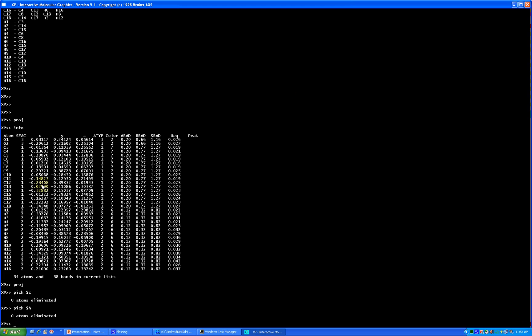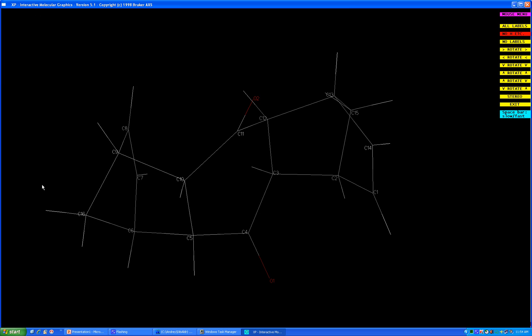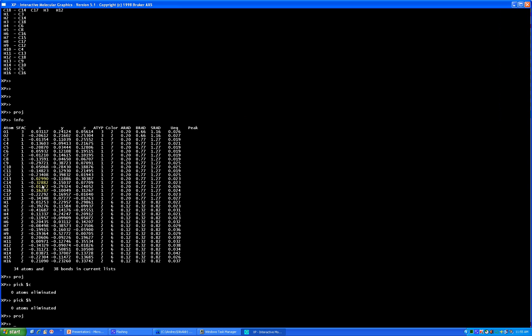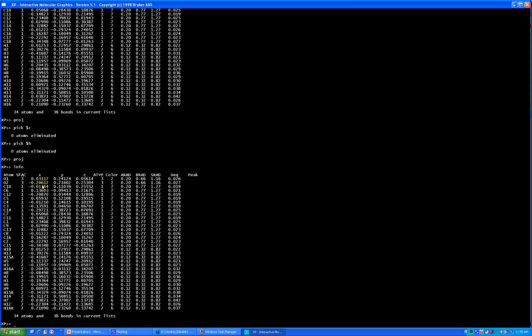Press enter when done, and let's check our numbering scheme to see if we made any errors. Let's display all labels and look — everything looks absolutely fine. All our carbons and hydrogens are labeled. Let's escape from here and type 'info.' You can clearly see that right now our atomic list doesn't have any order.